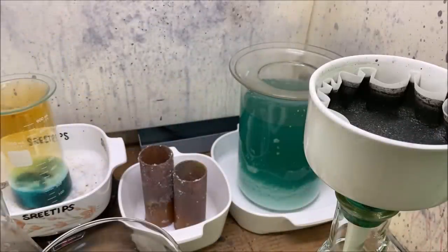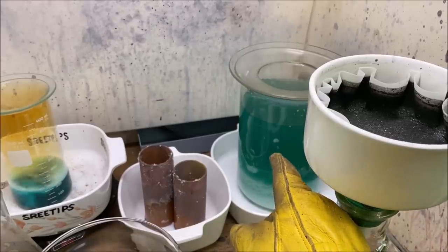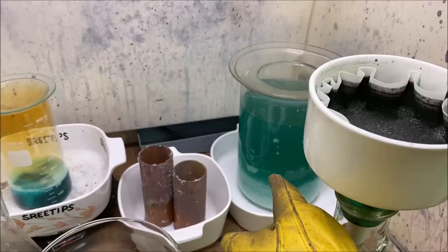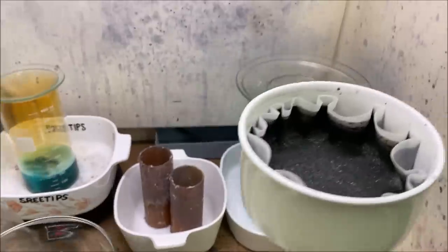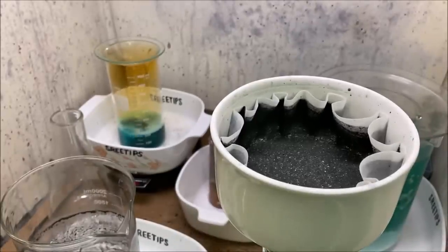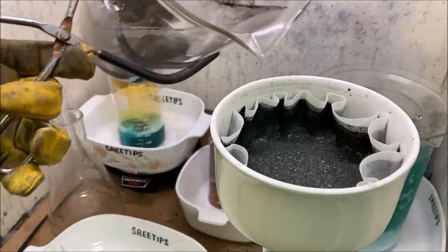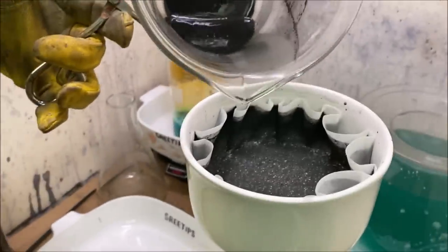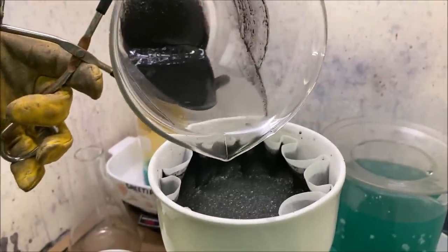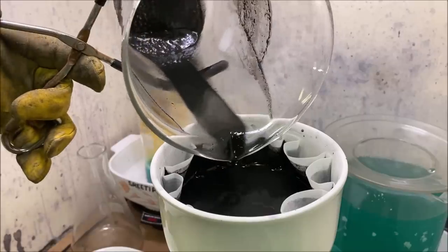I removed the pieces of copper from the solution back there. Can't possibly do any good. What we'll do is hit that with hydrochloric acid, convert everything to silver chloride, and then I'll recover the silver that way. For right now, what we're gonna do is add the rest of these solids to our filter. This will be the final group that needs to go in here.